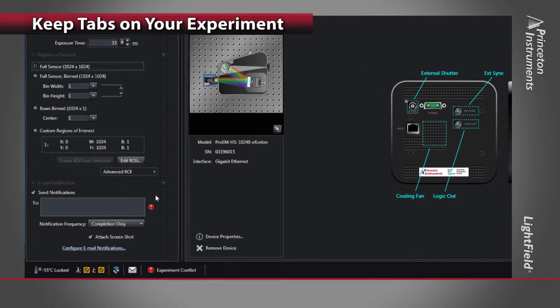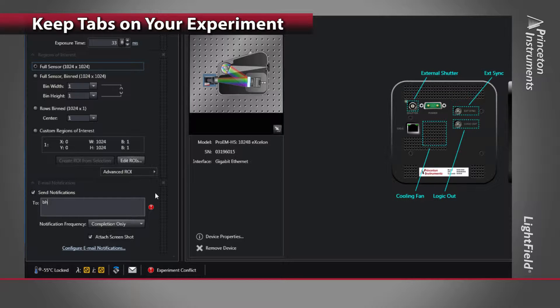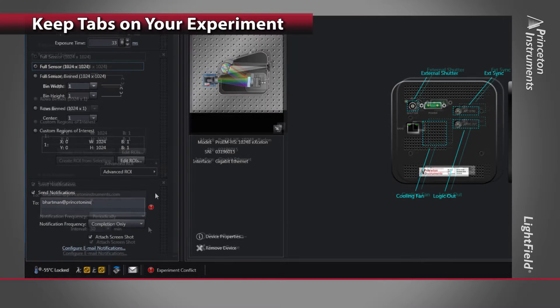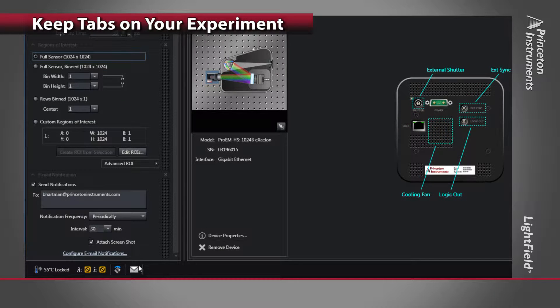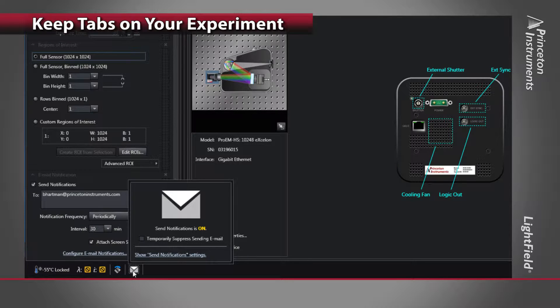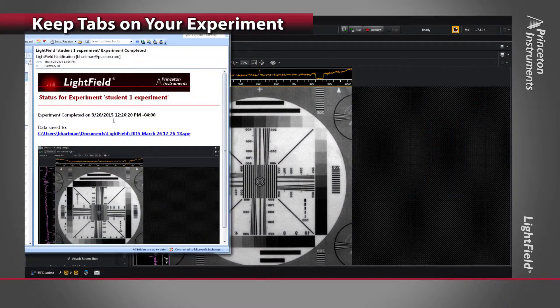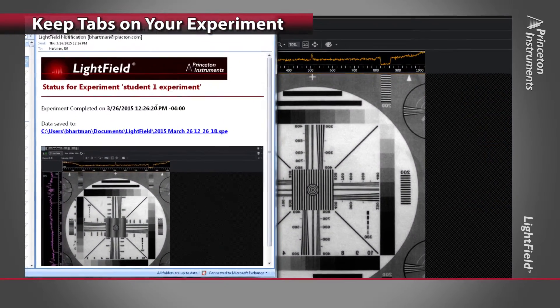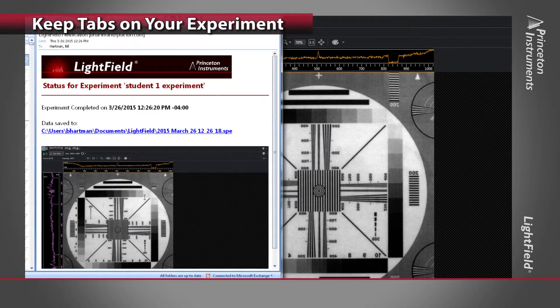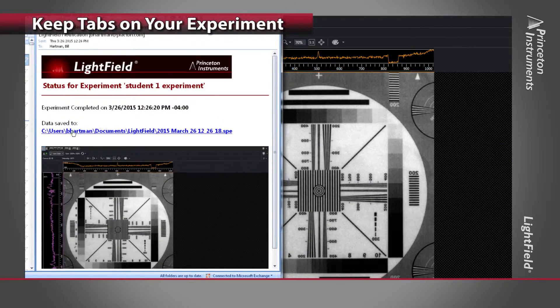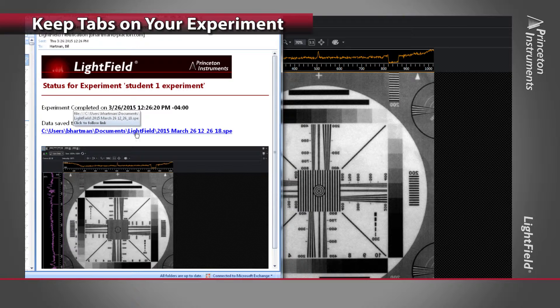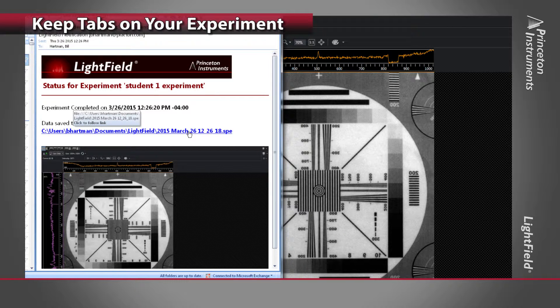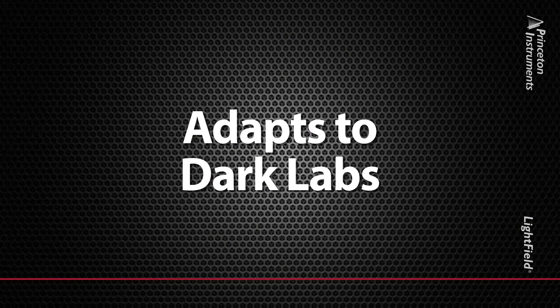Spending long hours in the lab running your experiment? Lightfield allows users to run experiments unattended thanks to built-in email support. Simply set up the email notification option to get regular updates on the progress of your experiment right on your mobile phone. Lightfield also sends a screen capture of the data window and a link to the data file for quick review. You can even send emails to multiple users on your team.